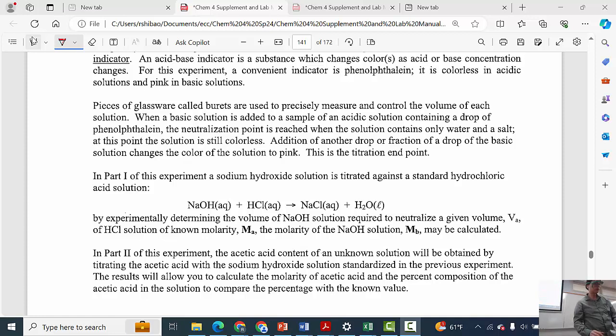That's probably too much. And then what I'm going to do is just try to rinse the water off the walls of this. I have this much, and you can hold this almost horizontally without it spilling out. Weird. And then just rinse off the inside walls here, and then I'm going to rinse off the valve and the tip of the burette. And then maybe drain off the excess up the top here. Maybe rinse it twice, that should be enough.